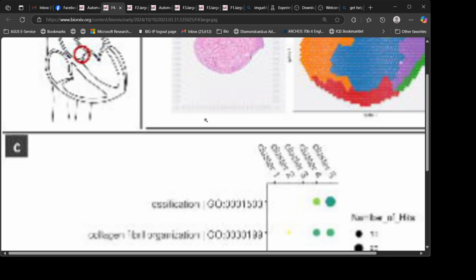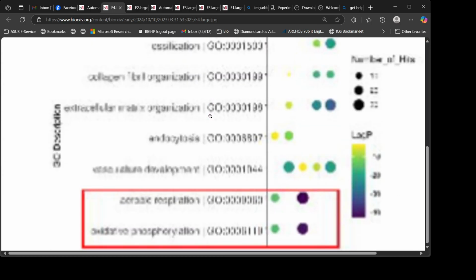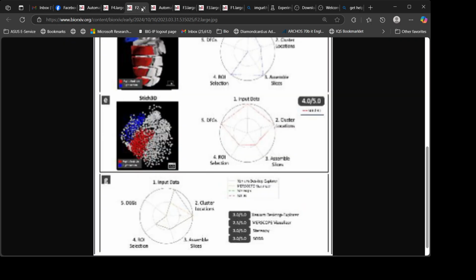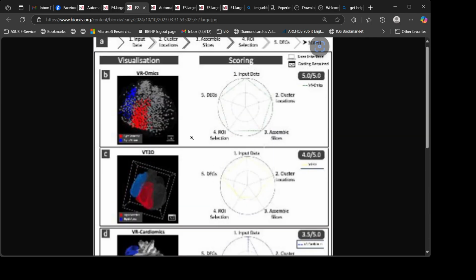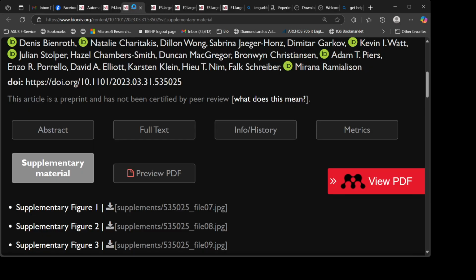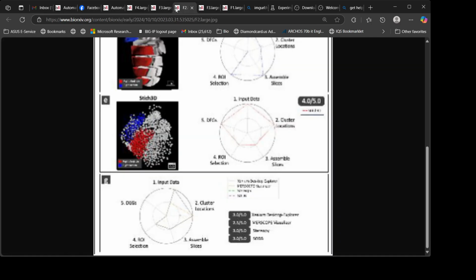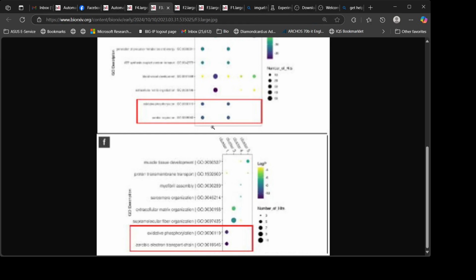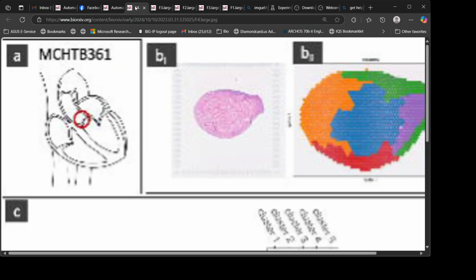Within these predominantly abnormal cardiomyocyte clusters, Figure 3 and Figure 4, there was evidence for altered transcriptional signatures through increased expression of genes such as SLC25A4, which is consistent with increased metabolic activity. 31. Certain cell clusters also displayed upregulation of genes involved in the increase of glycolysis, potentially indicating the presence of the Warburg effect, which may contribute to the growth of these benign tumors. 29. Moreover, the clustering performed across samples reveals additional transcriptional heterogeneity that cannot be identified using histological analysis of single-slice datasets, Figure 2 and Figure 3.